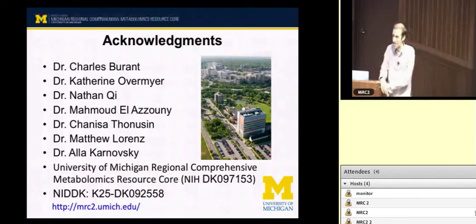Again, it's a case-by-case, metabolite-by-metabolite sort of basis. Things may be affected more profoundly. Some things may be completely depleted, and then you've lost all your signal. Some things, even though they're notably disrupted, you may still be just fine in detecting a change. So whatever you do, report it and do it consistently. But there are best practices and then less ideal procedures among those choices.